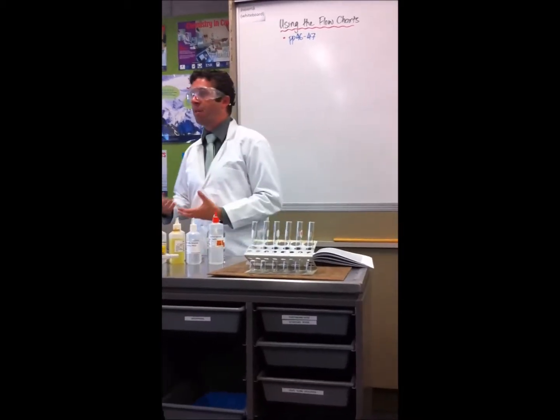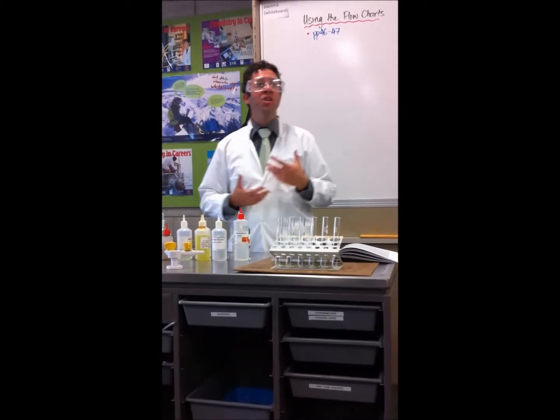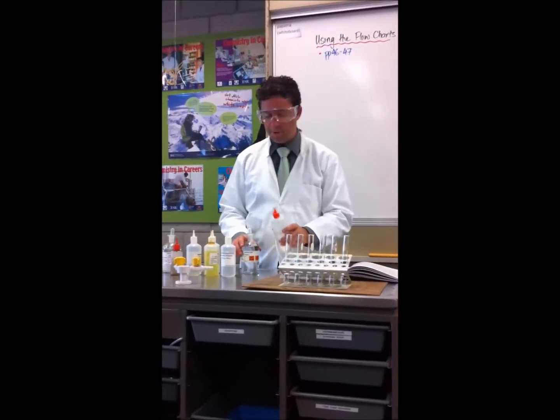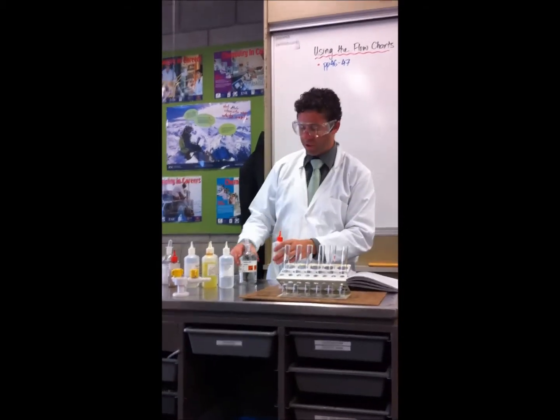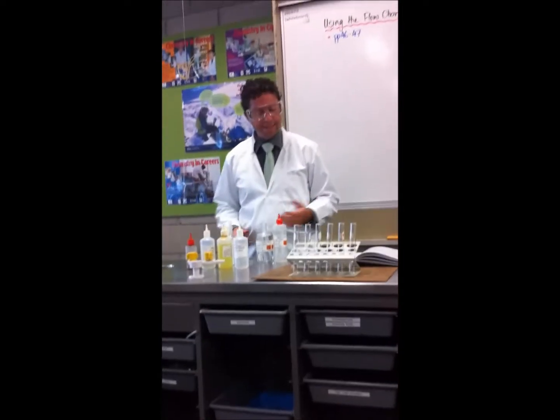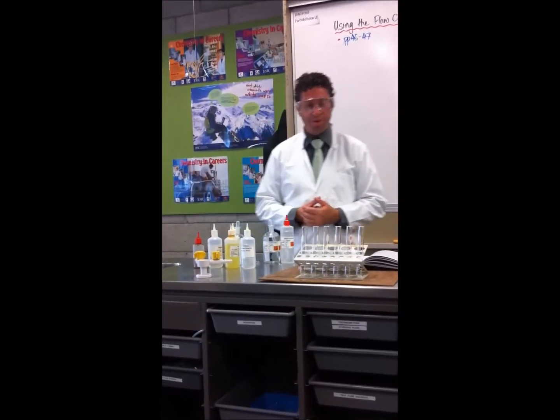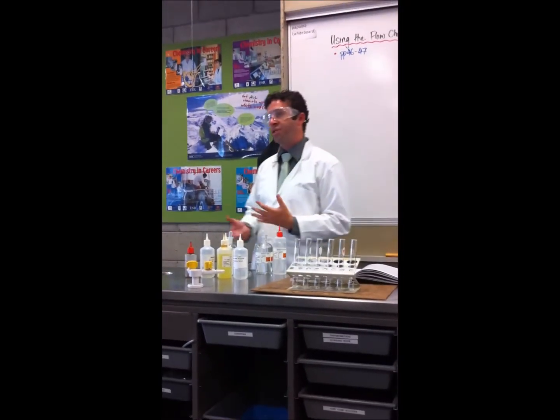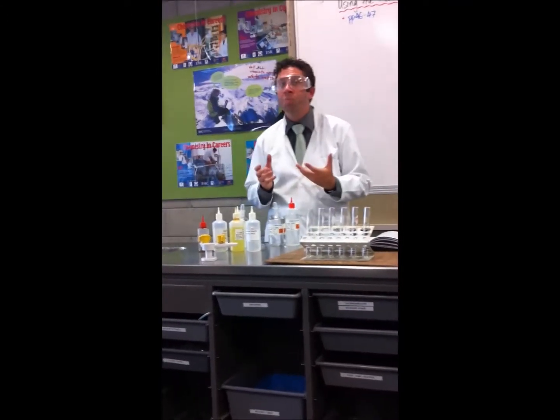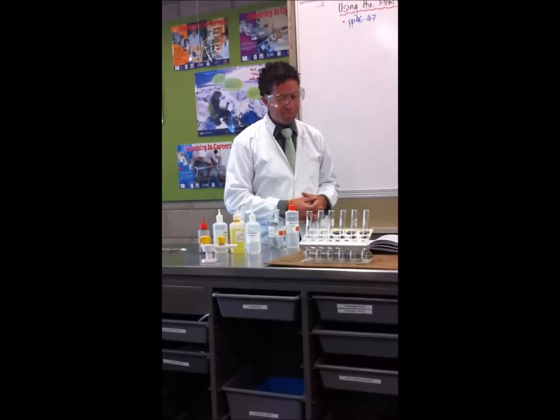So what I'm going to do is just show you a couple of things we can do with it, and then how we justify those and go from there. So what I've grabbed are some chemicals I'm going to need for testing, which is sodium hydroxide, sulfuric acid, and ammonia. They are the main ones that I'm going to need. I could also have potassium thiocyanate, which will give me an opportunity to do a complex ion one. So if we get one that could be iron 3+, I'll grab that then.